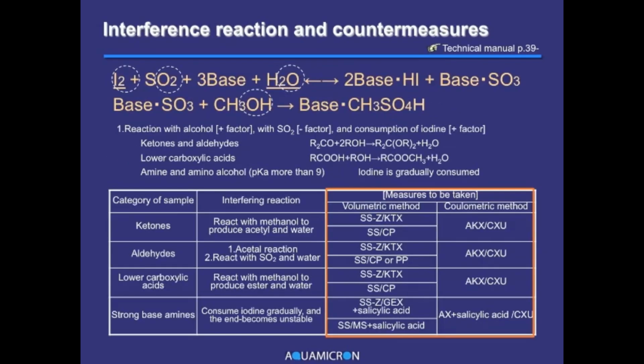I would like to explain in the next 2 slides about interference in the Karl Fischer reaction and countermeasures to deal with such interference. To tell the truth, there are various interfering substances in the Karl Fischer reaction. Since details about them are described in pages 39 to 45 of the technical manual, I recommend that you read them. In this presentation, I will summarize them.